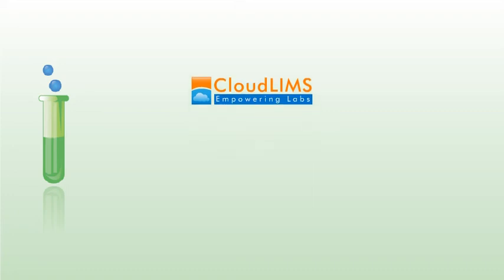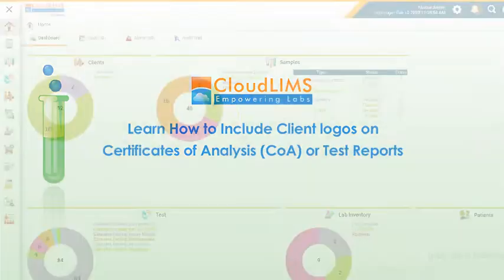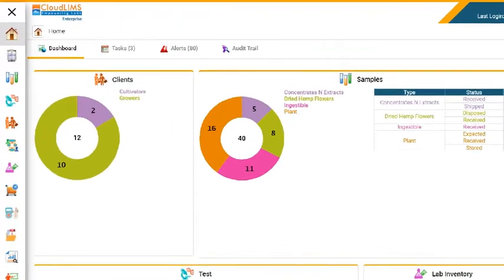In this video, we will walk you through the process of including client logos on Certificates of Analysis, COA, or test reports. As a first step, you need to upload the logo of your client.